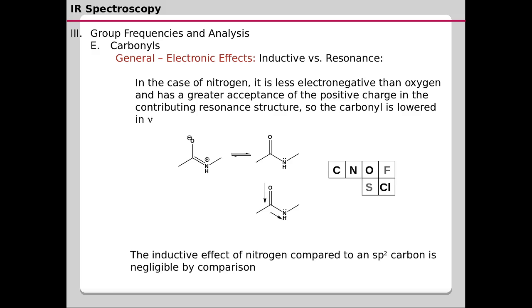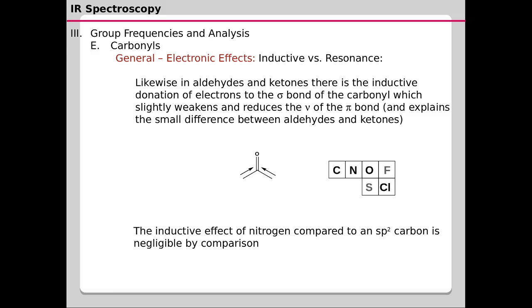Okay, but if we take the case of alkyl substituents on the carbonyl carbon, such as methyl groups, then alkyl groups are notorious electron donors through the inductive effect. As a result, say for example, if you consider two CH3 groups attached onto the carbonyl carbon, both the CH3 groups will be able to donate the electron density towards the carbonyl carbon.